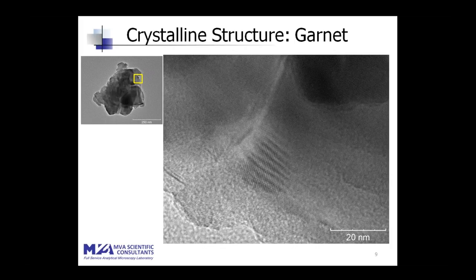And just as a general description of this particle, you can see that there's some variability in the thickness, and that plays a large role in the point that I'll be making here. You can see in the center of the image some dots and some lines that the dots then make up. Running sort of vertical are these lines that I've highlighted in yellow, in this area that I've highlighted in red, the entire little circle there where you can see the dots. So I said, okay, we have something here to look at and to try and measure.